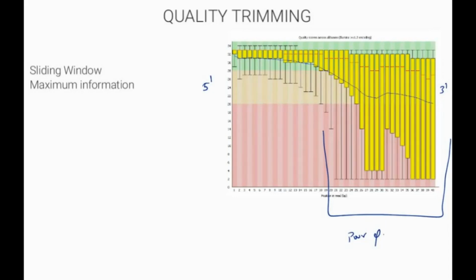The two methods of quality filtering are sliding window quality filtering and maximum info quality filtering. The sliding window uses a relatively standard protocol for scanning low quality bases from the 5' end of the read and removes from the 3' end if the average quality of a group of bases drops below the specified threshold. This approach of grouping bases together and taking the average prevents a single weak base from causing the tool to remove subsequent high quality data. The second method is quite a novel approach.